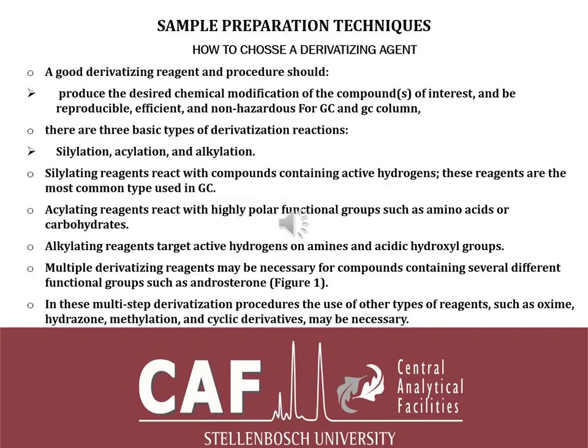Multiple derivatives: sometimes one might use multiple derivatizing agents, like for instance when you're working with androsterone, testosterone.